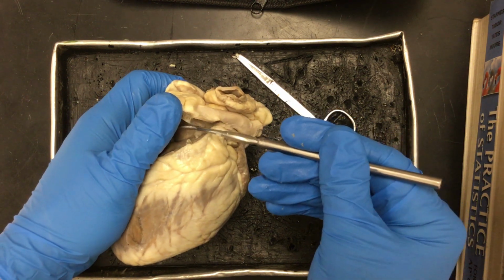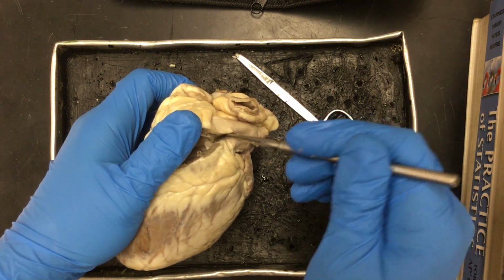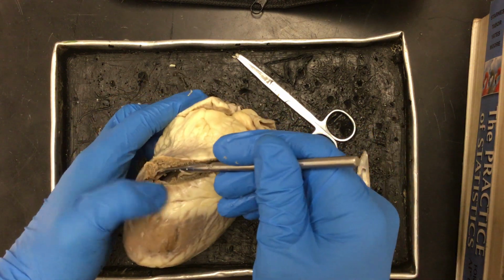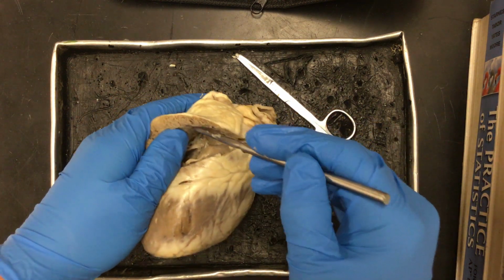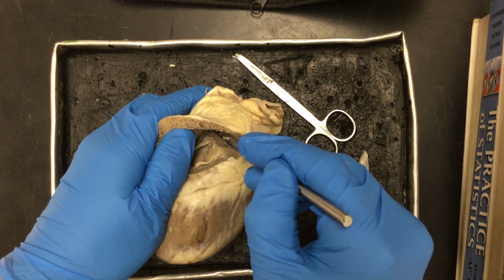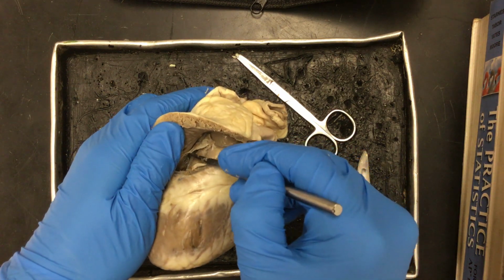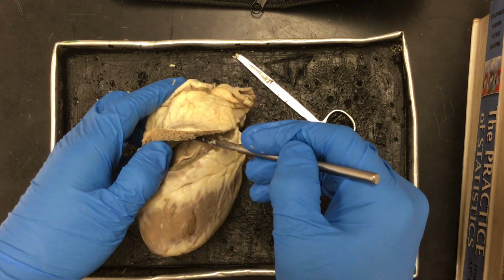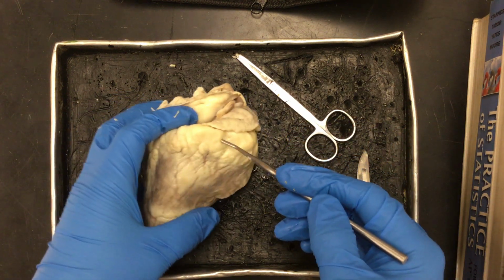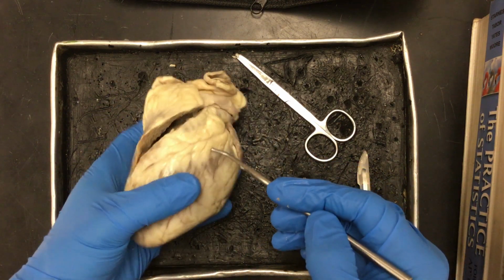And there's another valve here that I cut through on my way down that connected over here. So valves protect against backflow. Here we're inside the right ventricle. If you look up here, you can see the tricuspid valve. 1, 2, 3 flaps. 3 for the tricuspid. Okay.